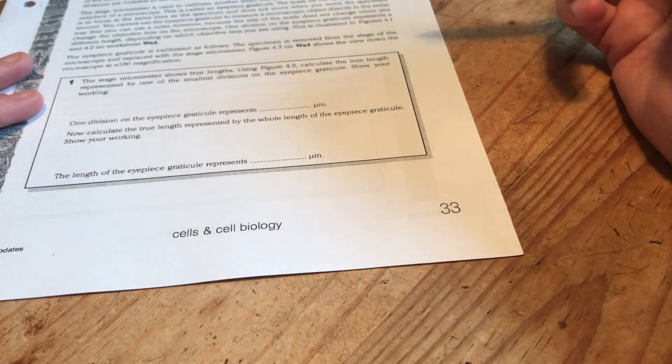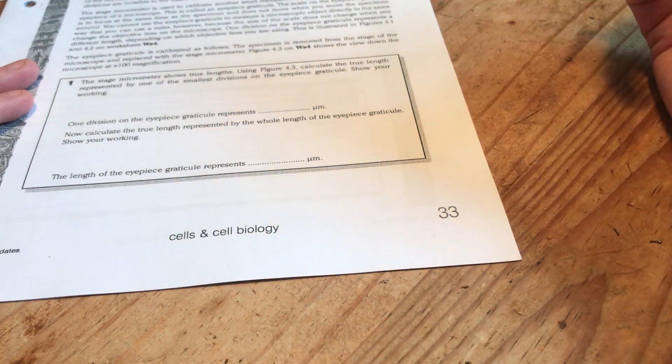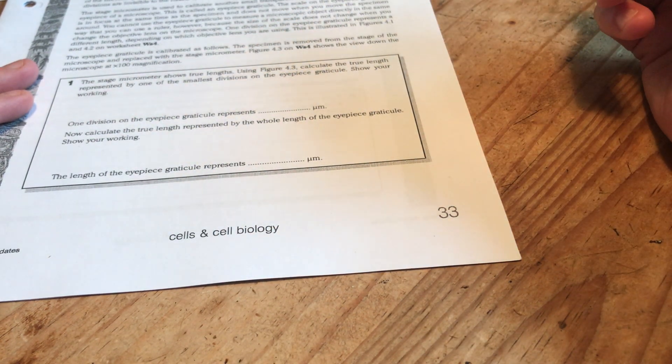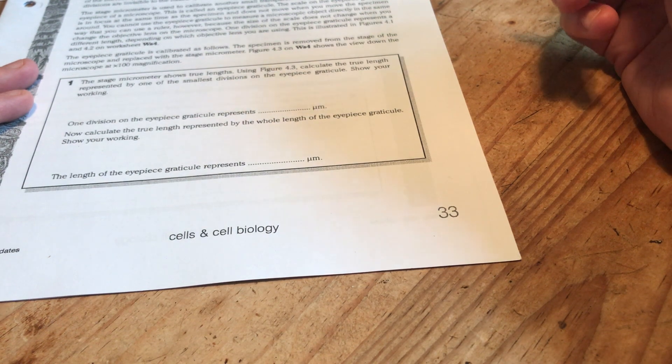So the stage micrometer shows true lengths. It's basically like a tiny tiny ruler. Using figure 4.3 calculate the true length represented by one of the smallest divisions on the eyepiece graticule. Show your working.